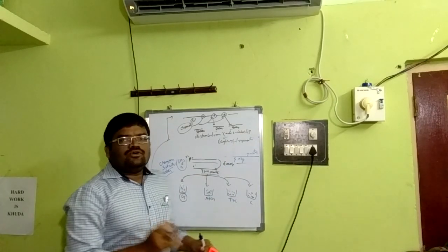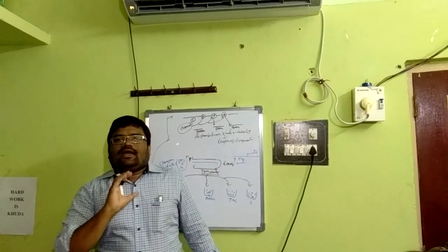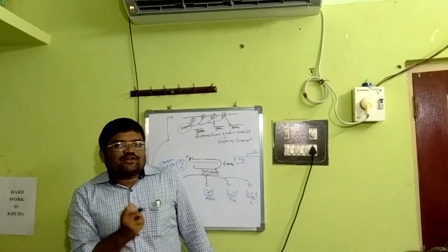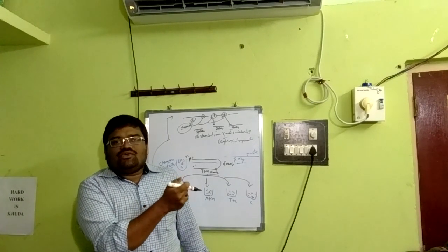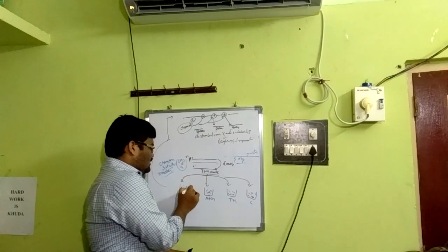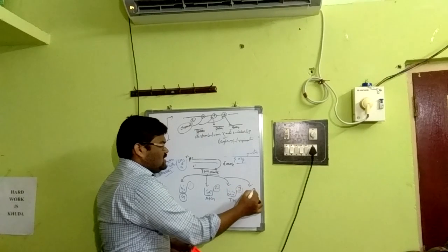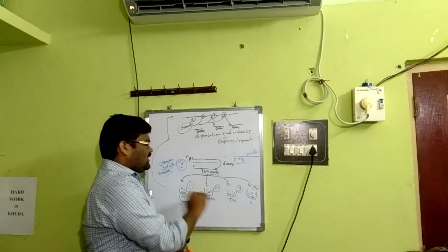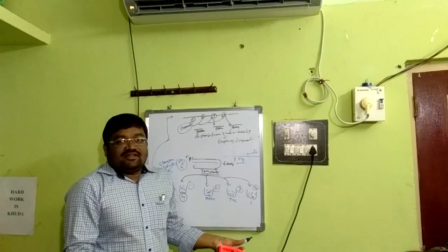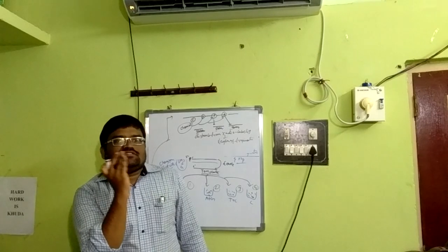This is very important. So, for example, the higher the distance from the radio labeling, the larger the fragment size will be. It depends completely on the distance from the radio labeling, giving different varying fragments in 4 tubes. Test tube 1 with G, the second with A plus G, the third with T plus C, the fourth with C. So different test tubes may have different lengths of DNA fragments because of this logic, because it acts on specific chemicals, that means specific residues.